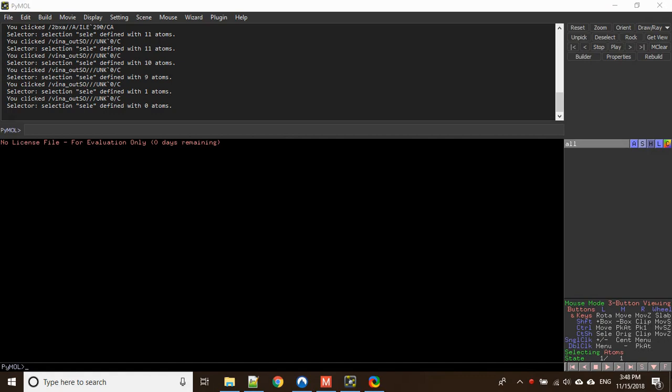Hello viewers, welcome again to Bioinformatics Review. In our last tutorial we discussed how to perform docking using AutoDock Vina, and today we will be learning how to analyze the docking results. We will be using the same protein, human serum albumin, and the ligand sodium octanoate. We need only two files: the PDB file of our protein and the output PDBQT file of our ligand.